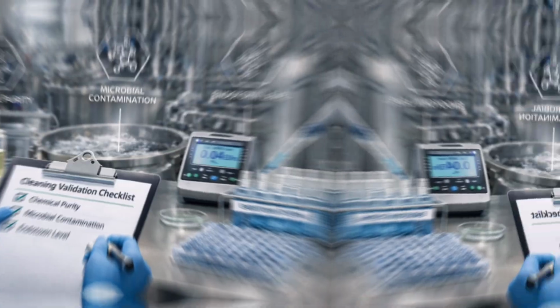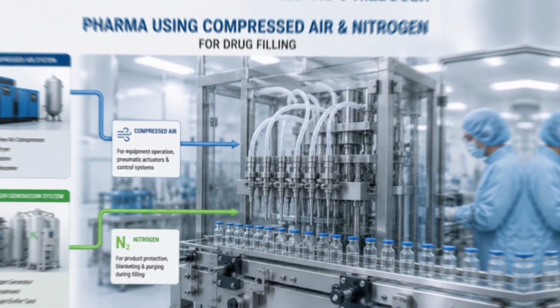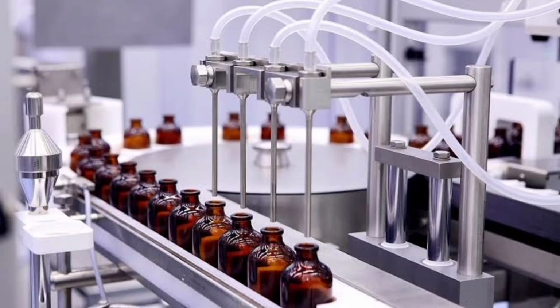And the second critical utility, gases. In our pharmaceutical industry, we are using 2 main gases, compressed air and nitrogen. These also validate the same microbial, physical, and chemical properties. Gases used in aseptic processes should be filtered through a sterilizing filter of 0.22 micrometer. Likewise, many details are described in this section, utilities.